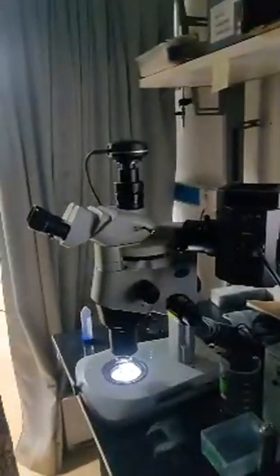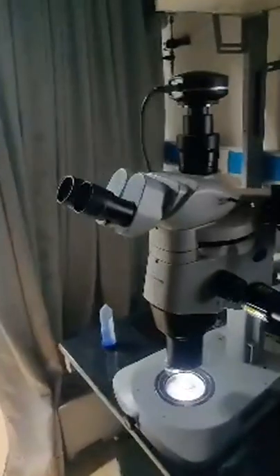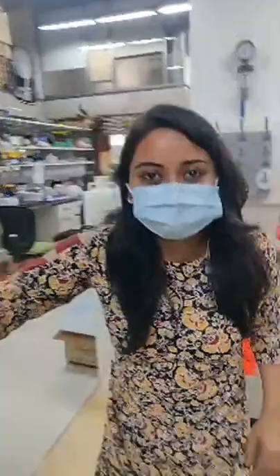So I can take you to the next room. What do these graphs and all mean? These are just for imaging, to be able to visualize it with the right kind of light. Those are the parameters, and they are set for us right now. The microscope is no longer a simple microscope. To record events and activities that are happening in the brain, we use something called electrophysiology.